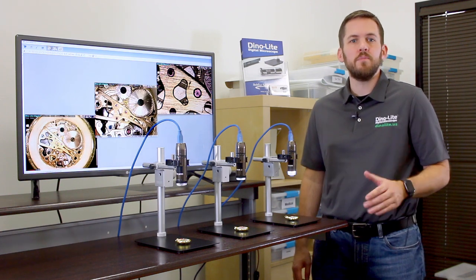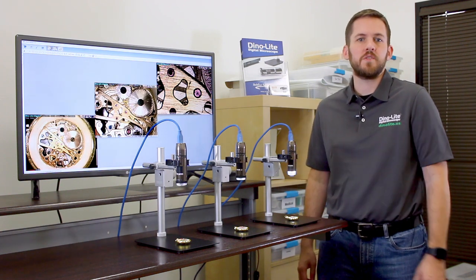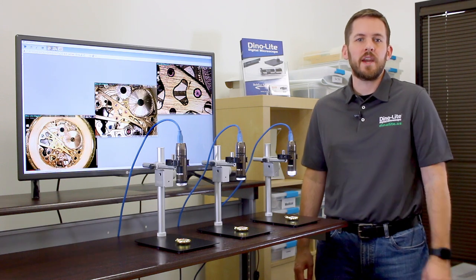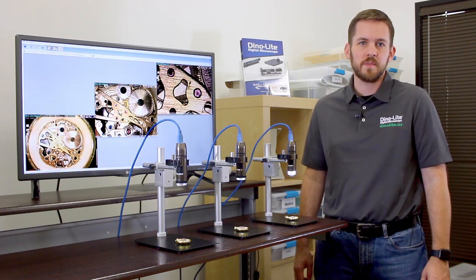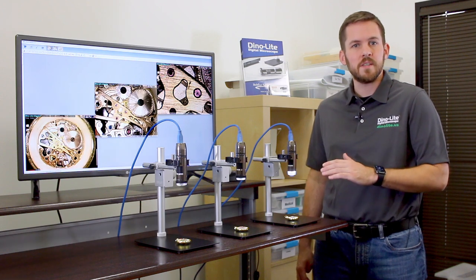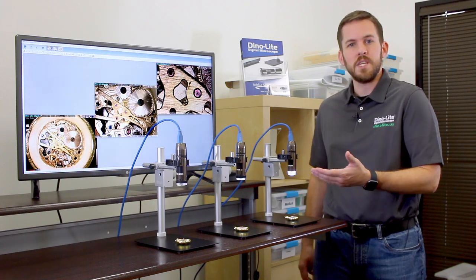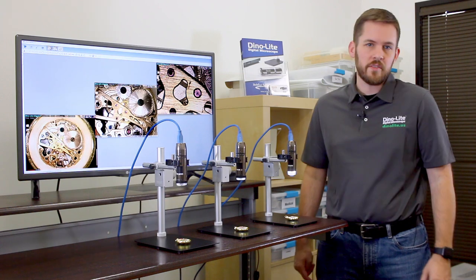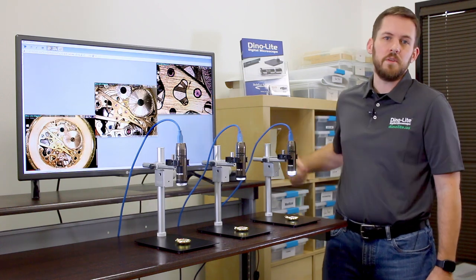So to demonstrate this I've moved each of these styles to five inches from the specimen and adjusted the magnification power to bring it into focus. And you can see while the far working distance style is at around 50x, the long has dropped to about 14x and the standard is at 7x magnification giving you a much bigger field of view.